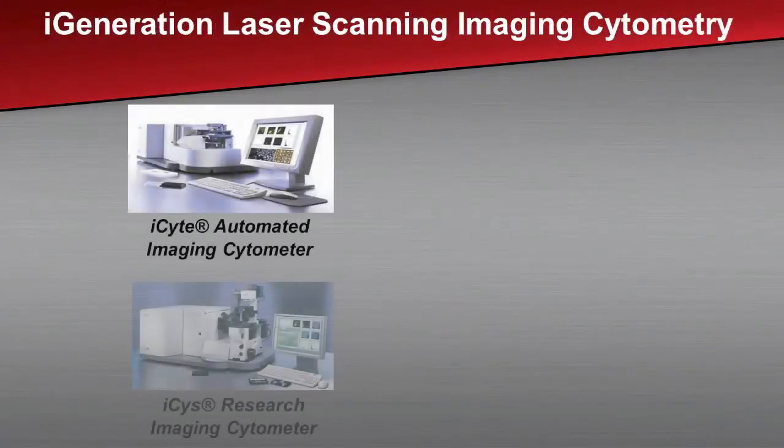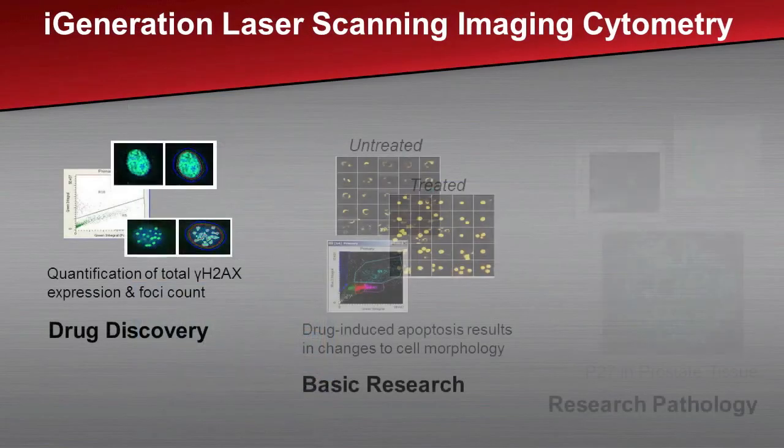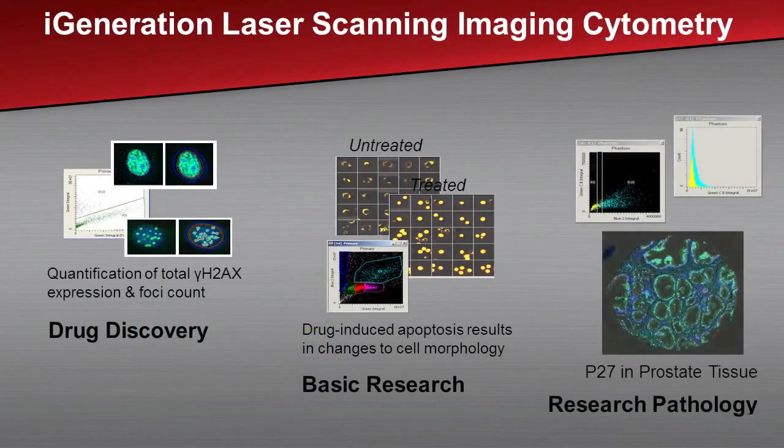LSC technology continued to evolve, with applications ranging from drug discovery to basic research to research pathology.